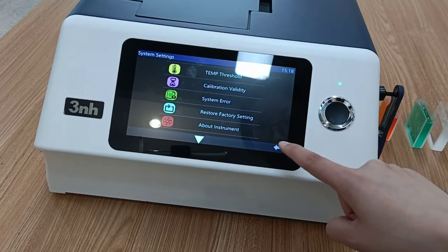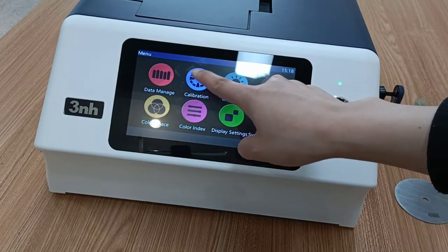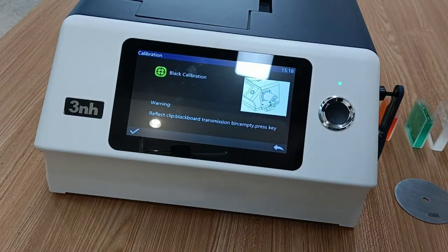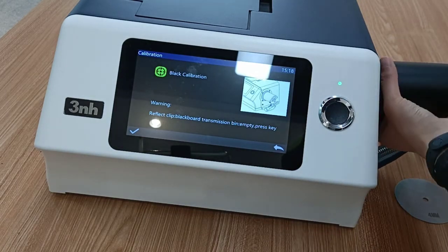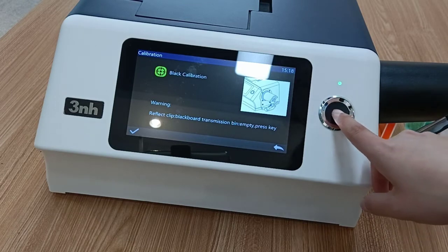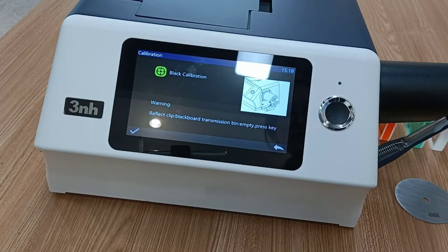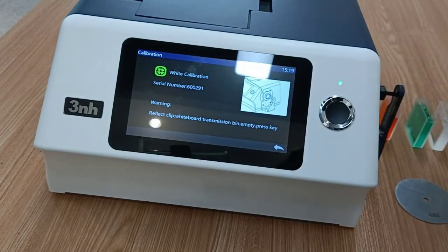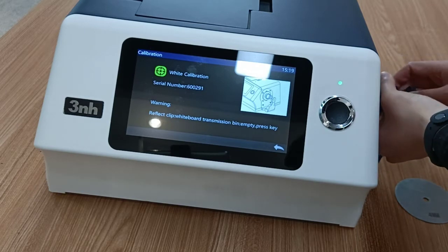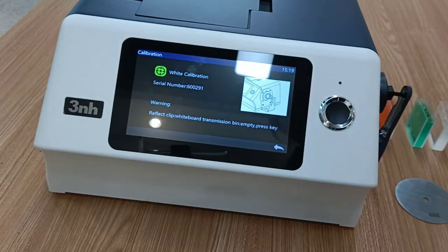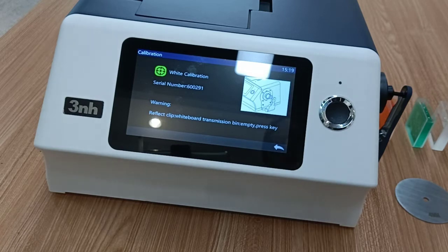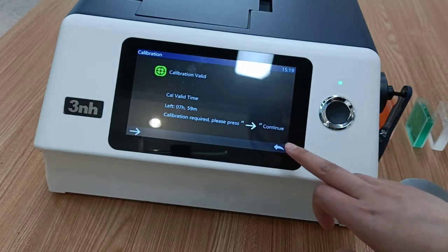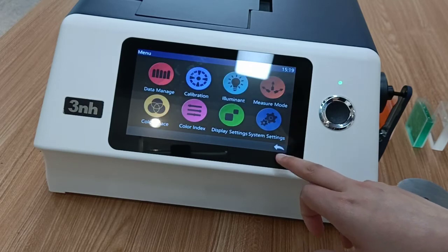After setting all the parameters, we begin calibration. We first do the black calibration — press the measuring button. It then continues into white calibration, so we perform white calibration next. Press the measuring button again. After calibration is complete, we can return to the test interface.